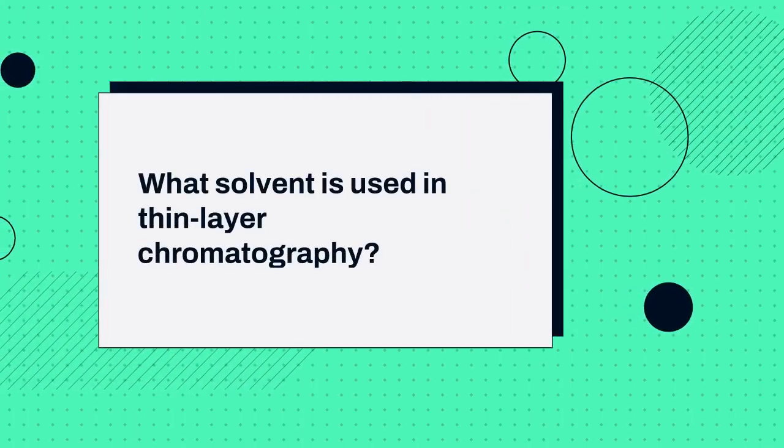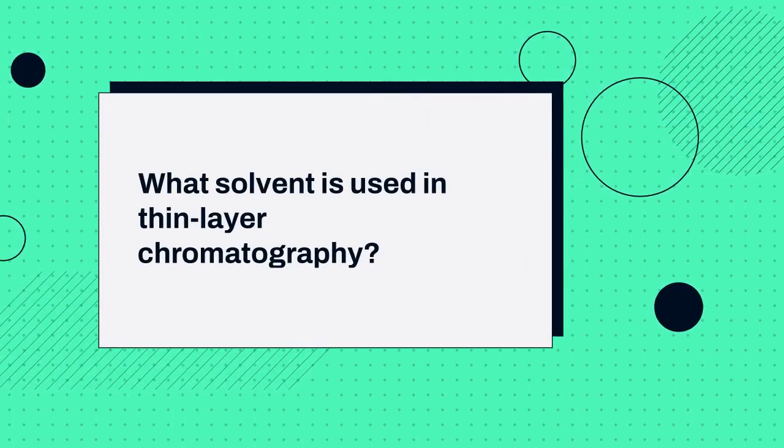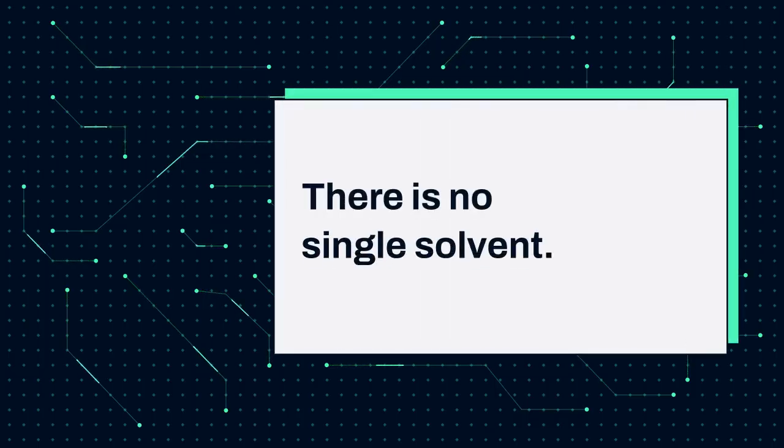Hello everyone and welcome. Today we are answering a fundamental question in chemistry: what solvent is used in thin layer chromatography, or TLC? The simple answer is that there is no single solvent. The real answer is all about finding the perfect solvent system for your specific experiment, and that's what we'll explore.